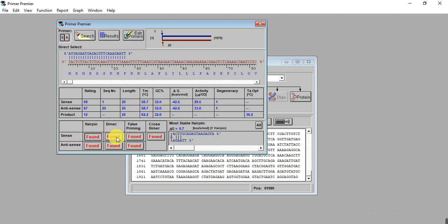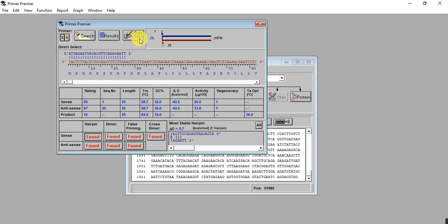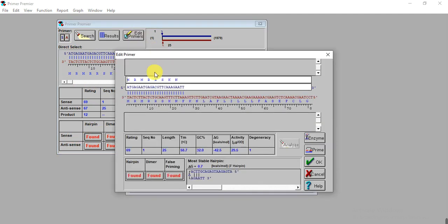Keep in mind that besides annealing temperature, length, and GC content, your primer should not have hairpins. If a primer has a hairpin, it's difficult to anneal with your target sequence, so you must remove that hairpin. First we need to edit the sense primer to remove that hairpin. Select S, then go to Edit Primer. You can edit by removing base pairs at the three prime end.